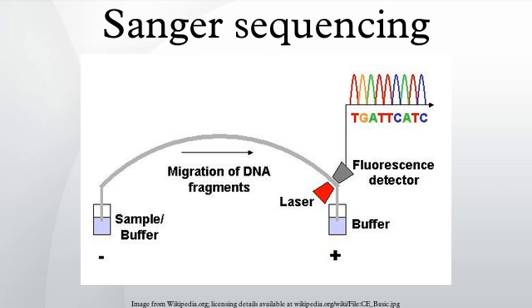Amplified base ladders are then separated by capillary array electrophoresis with automated, in situ, in-line detection of the fluorescently labeled ssDNA fragments, which provides an ordered sequence of the fragments. These sequence reads are then computer-assembled into overlapping or contiguous sequences which resemble the full genomic sequence once fully assembled. Sanger methods achieve read lengths of approximately 800 bp.